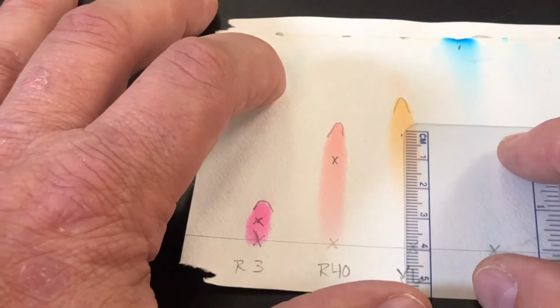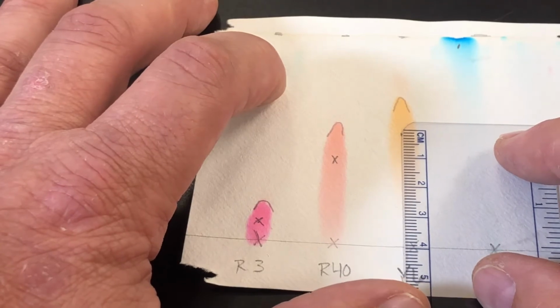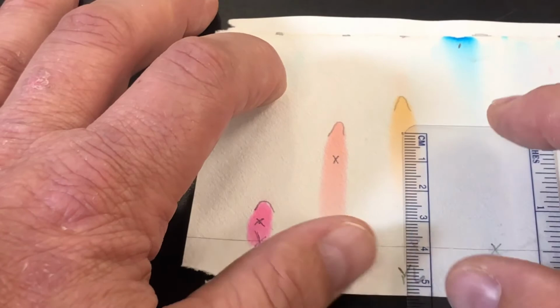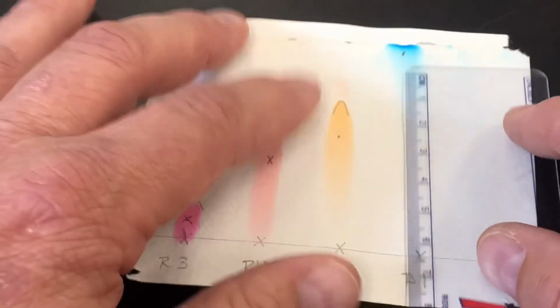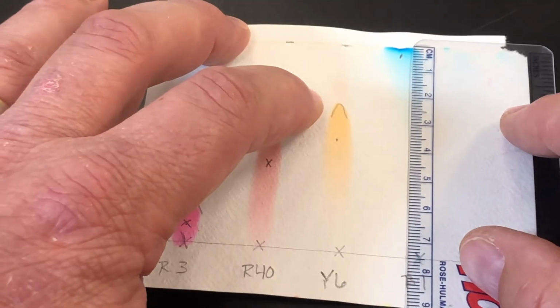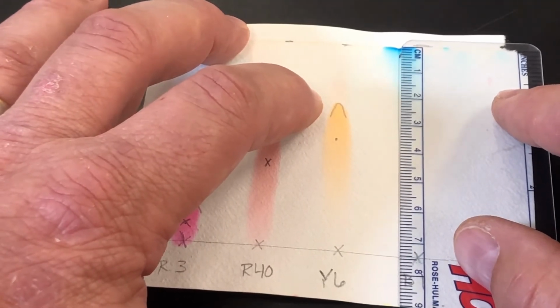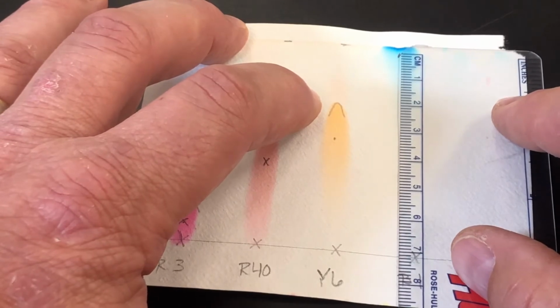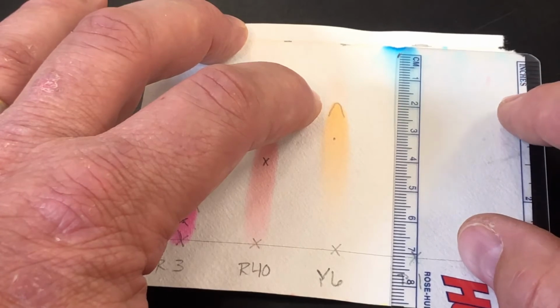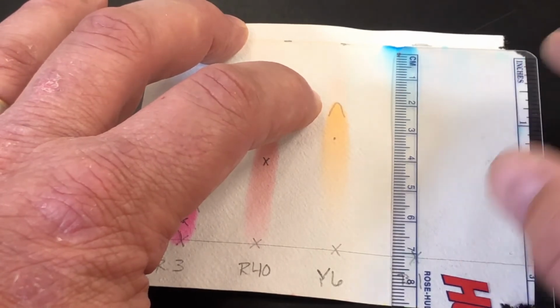And probably center mass is somewhere in here. This is just a guesstimate. I'm going to say it's about a 3.80. For the blue, we're going to see that the blue traveled 7.50. The very tip is 7.50. And if we did this center mass of the depth of color and the average of it, then I would have gotten about a 7.10.